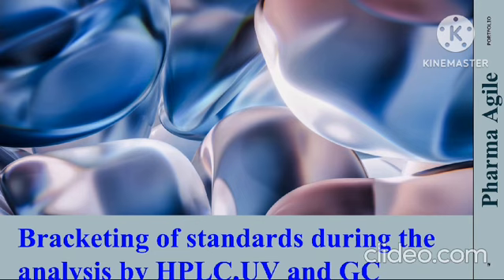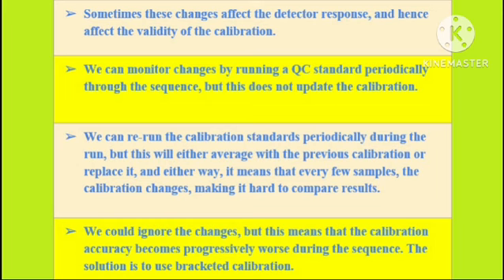In this video, I will discuss bracketing standards. Why do we use a bracketing standard in HPLC analysis? If you want the purity of the sample or to identify any impurities in the sample, how do you know the purity? We can analyze the sample, then we will know the purity of the sample.